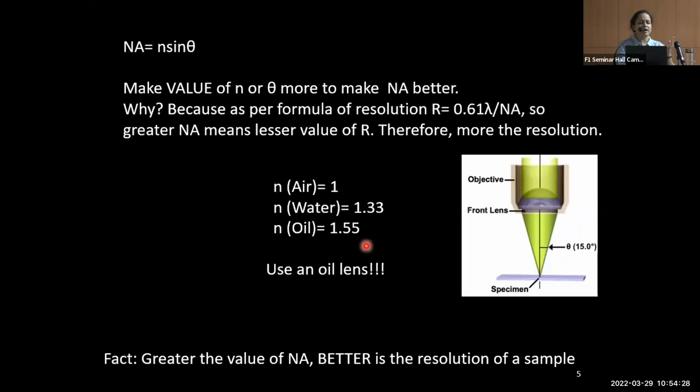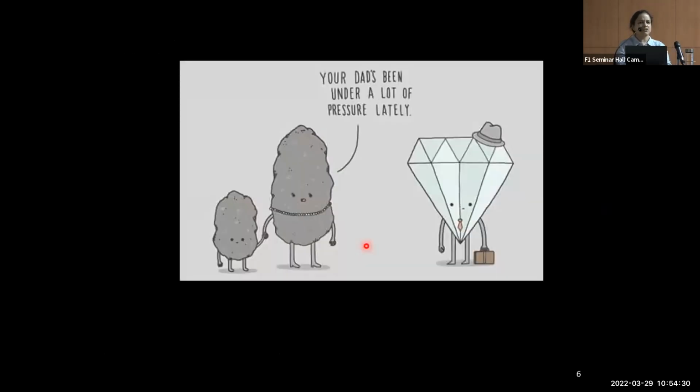Why am I saying all this? Because you have a very, very precious element of your microscope. Can someone tell me, what do you think? Leave the camera apart, that's an add-on. What is the most precious part of this microscope? Anyone? Lens. It's like a diamond, a girl's most precious. Why is the diamond very expensive? Can anyone say that? It's not rare, right? Why is it expensive? Why is the diamond expensive?